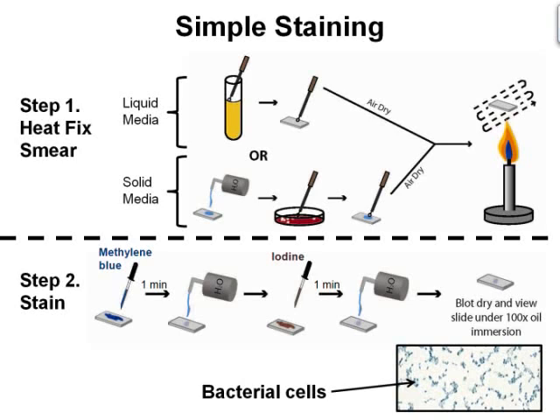First, cover the smear with methylene blue. Allow the dye to remain on the smear for approximately 1 minute. Note, staining time is not critical. Somewhere between 30 seconds and 2 minutes should give you an acceptable stain. The longer you leave the dye on in general, the darker the stain.